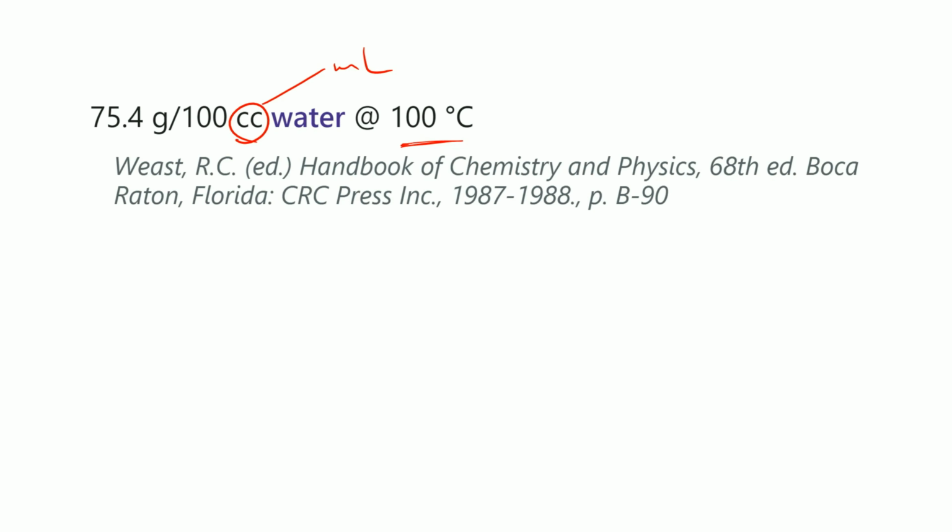So you can see I'm really not being too accurate here. I tried to show you the math, show your rounding, do the right method, yes, but I don't really care too much for this prac. I just want something rough-ish.